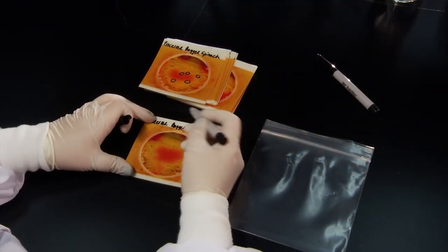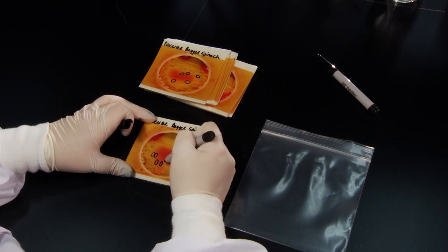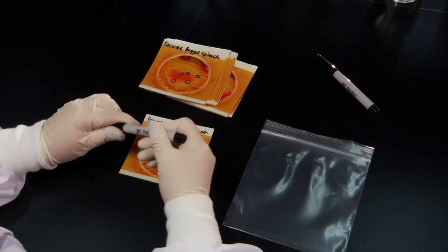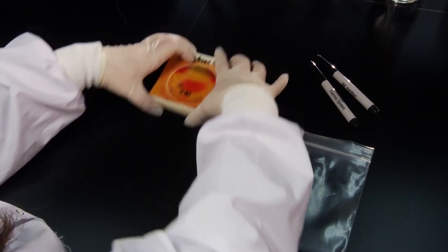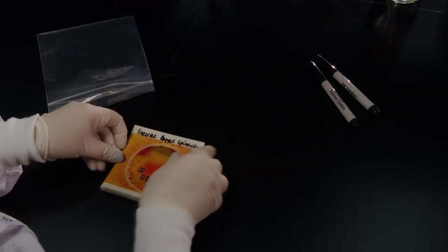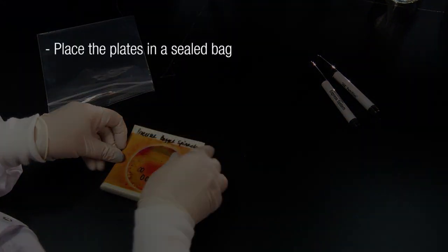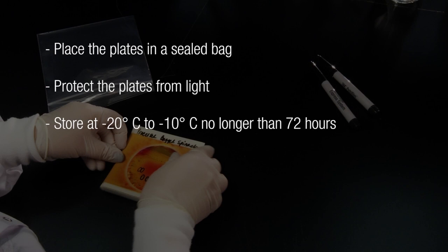Finally, if the 3M PetriFilm Salmonella Express plates cannot be analyzed within one hour of removal from the incubator, circle the presumptive Salmonella colonies on the top film with a permanent ultra-fine tip marker. Place the plates in a sealed plastic bag. Make sure to protect the 3M PetriFilm Salmonella Express plates from light and store the plates at negative 20 to negative 10 degrees Celsius for no longer than 72 hours.